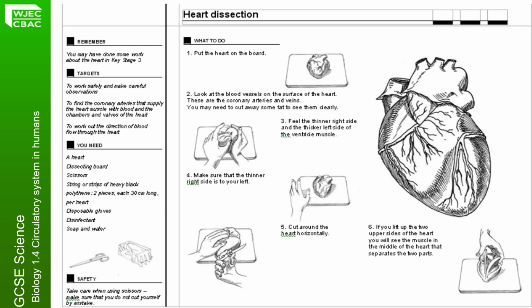Big safety thing here, as I've already said, make sure when using scissors or a knife that you do not cut yourself by mistake. Always cut away from yourself. Try not to hack, use small, gentle movements of the knife.